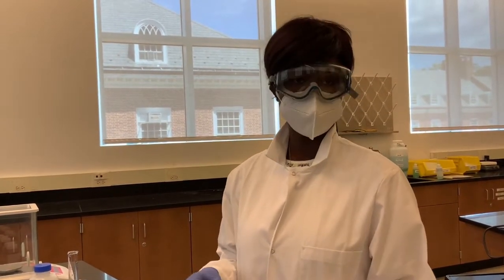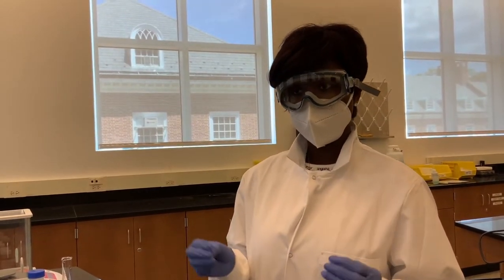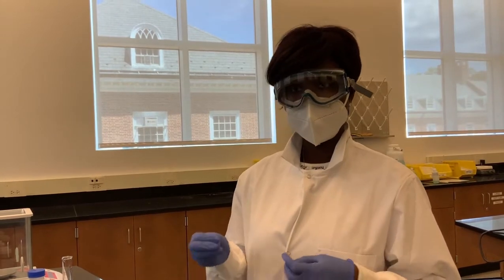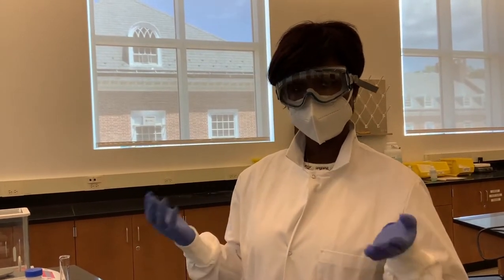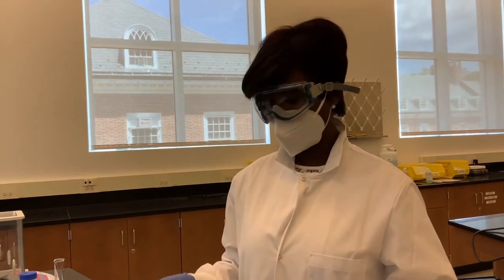So we are going to use several methods in chemistry to separate these 3 components. And in this separation, we want to be able to retrieve each of the components in its original form, right? That is, we want to separate the salt from the sand and the chalk also from the sand, so we have the 3 individual components isolated.